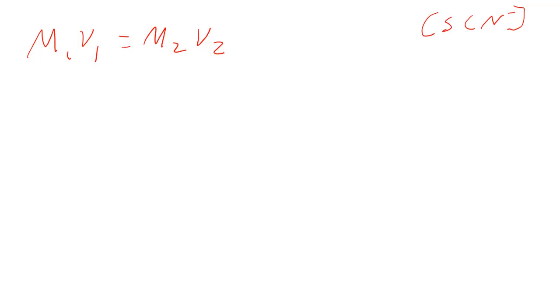Your lab handout shows you a slightly rearranged version of this equation that you can also use to do the calculations, but this is going back to how we've been doing it since Chem 111. So we start with 0.0020 molar potassium thiocyanate, and we're going to look at test tube 1 here.